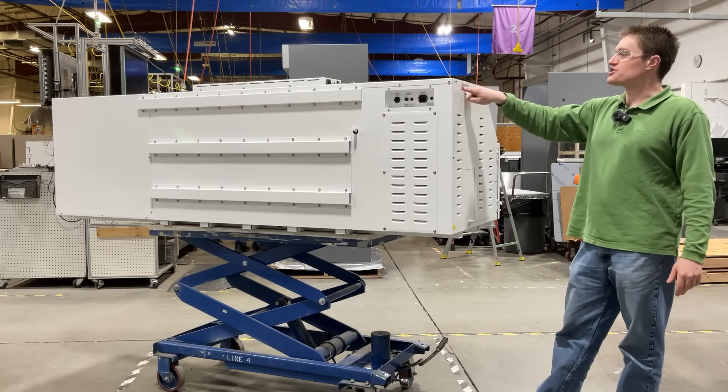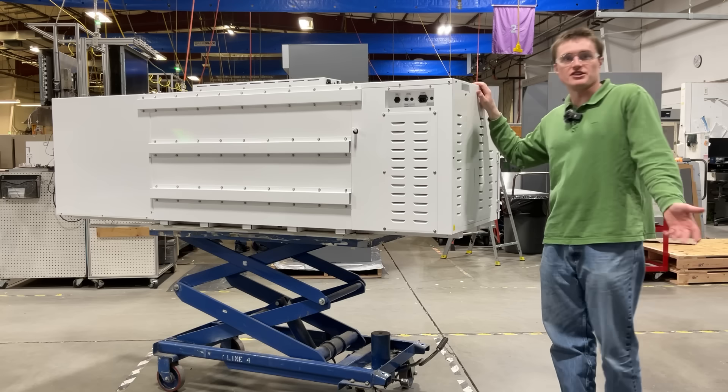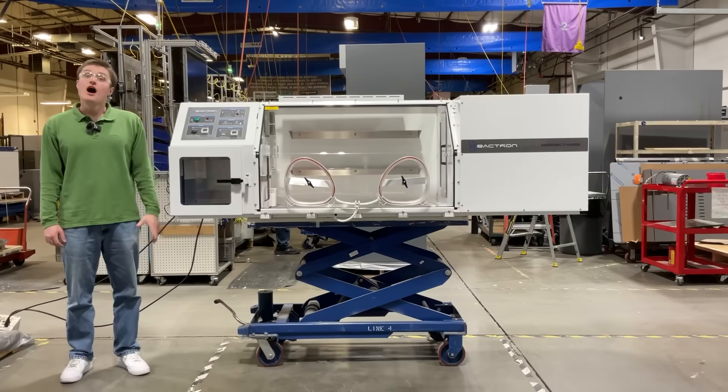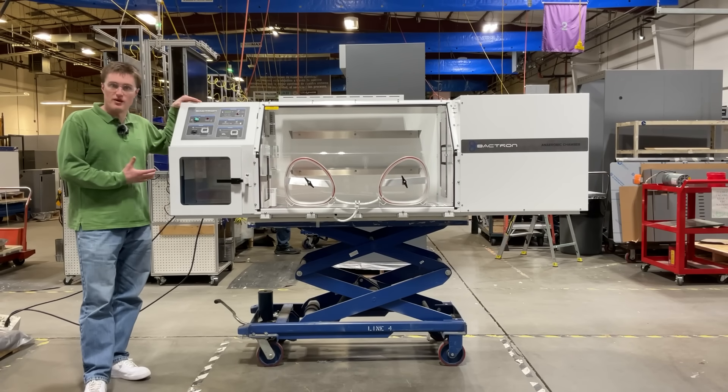Last, you will see the nitrogen and the AMG inlet on the left side of the unit. This is where you connect your gas supply. Now that we've got the unit plugged in, let's get it powered on and take a look at some of the control panel functions.